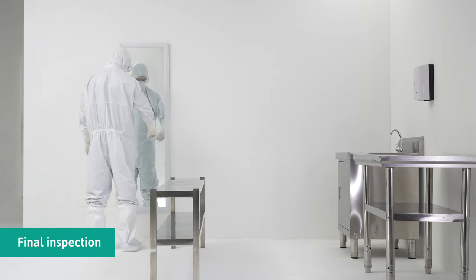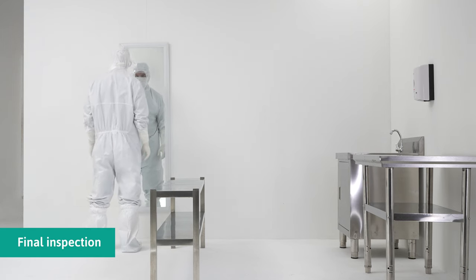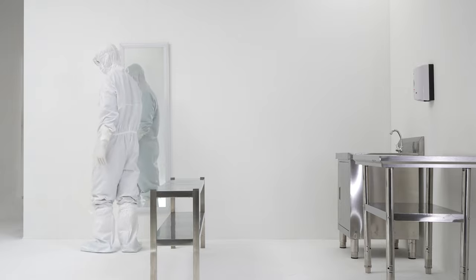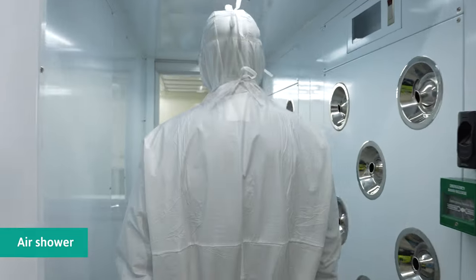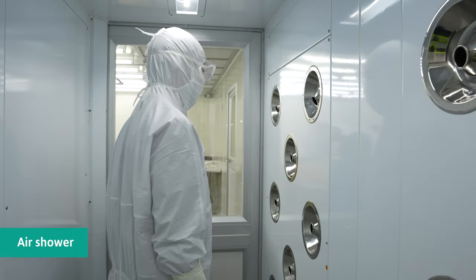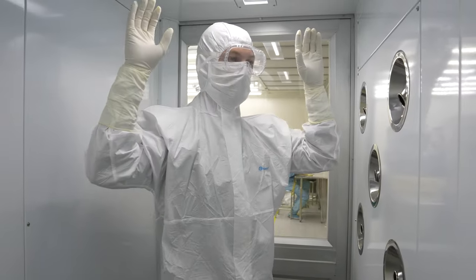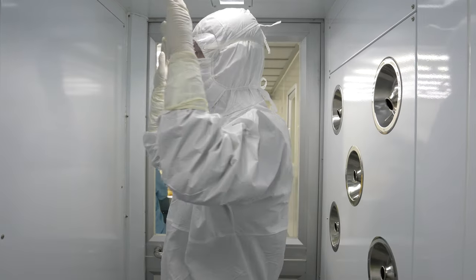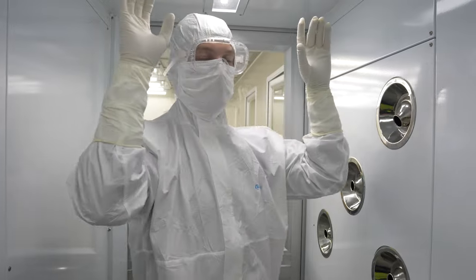Ensure all garments and accessories are correctly fastened and secured prior to entering the cleanroom. There should be no skin, hair, or inner garments exposed prior to entering the clean and aseptic area. The wearer must go through the air shower chamber. When the air shower begins blowing, the wearer shall rotate and lift their hands upwards to expose as much surface area to the airflow as possible.